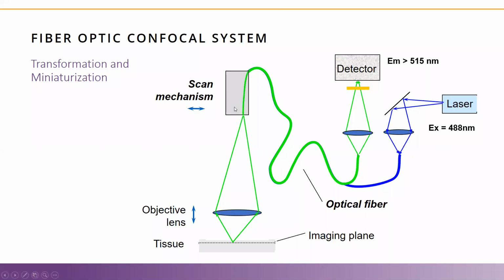And because of this fiber, it can be combined with a probe and it goes endoscopically. So that is the reason why it is given the name laser confocal endomicroscopy, because it is using laser. It is combining the technology of confocal systems and it performs endoscopical microscopy. So that's why this LCE. So you will find a lot of articles in the literature with this laser confocal endomicroscopy technology.